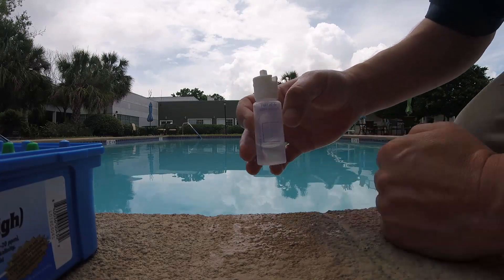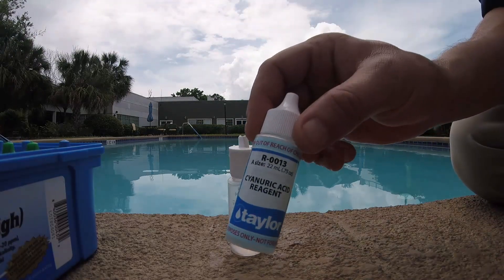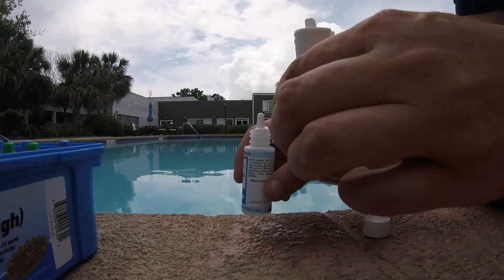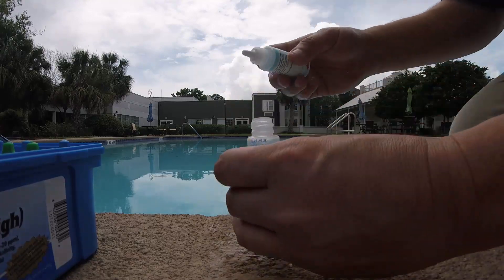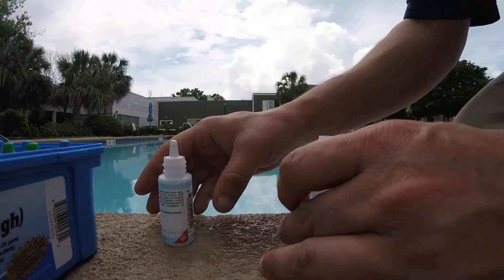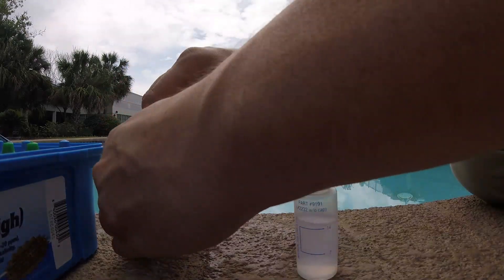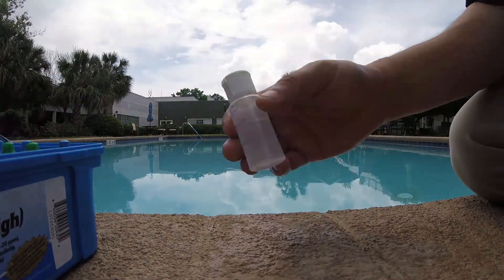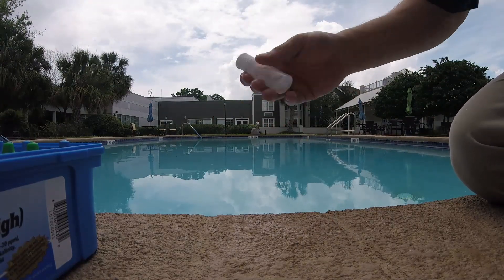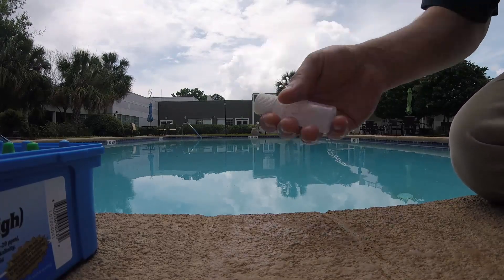I don't want an inaccurate reading for the health department. Then you take the cyanuric acid reagent — this is a kind of an expensive test actually. I have more of this stuff in a bigger bottle. You squirt it in there until it fills up to the 14 ml mark. Then cap it and shake it for 30 seconds.